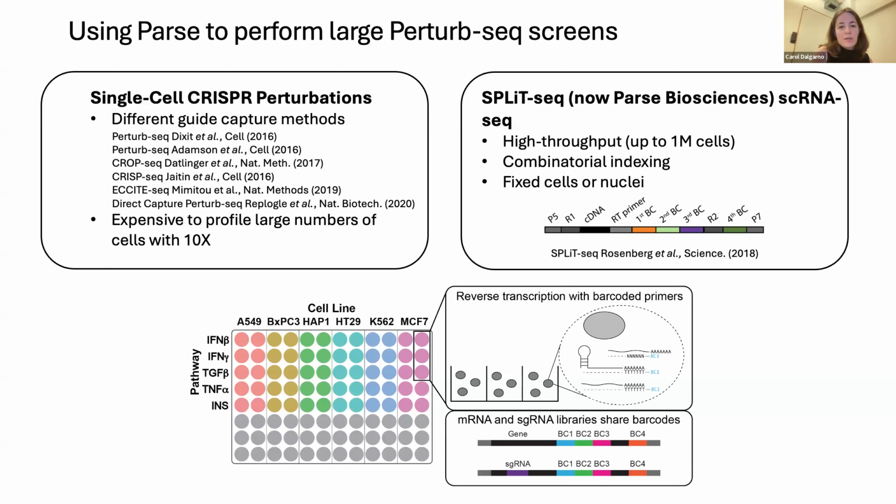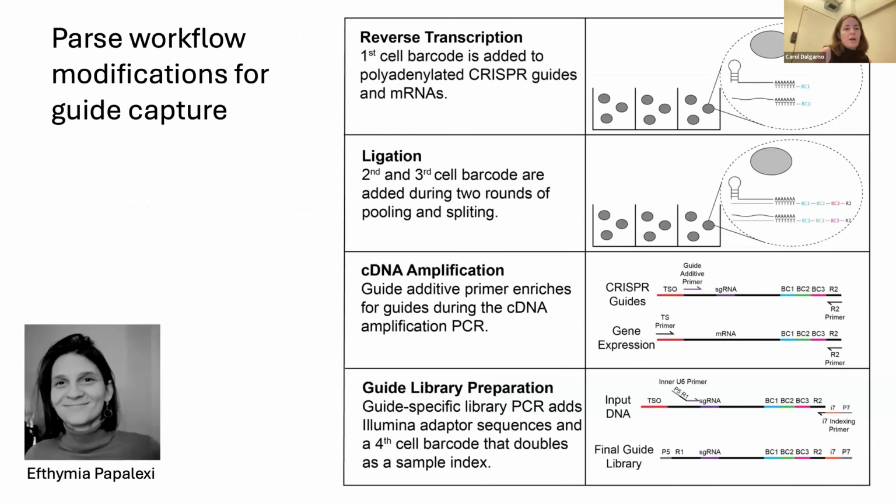So we combine these two existing methods to develop a method to capture guide RNAs with the Parse whole transcriptome kit using guide-specific modifications. And before I go into what these modifications are, I just wanted to quickly acknowledge Effie Papalexi, a former PhD student in the lab, for her work on developing this guide capture method.